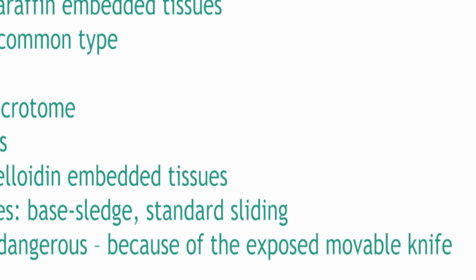So, for example, somebody is talkative, chatting away, and doesn't notice that they've already cut a section. Hi, Patrick! They greet Patrick, even fixing their hair. Hi, Patrick! Then Patrick gets hit by the sledge microtome, the Adam's microtome. Oh, she's wounded. Okay? So, yon.